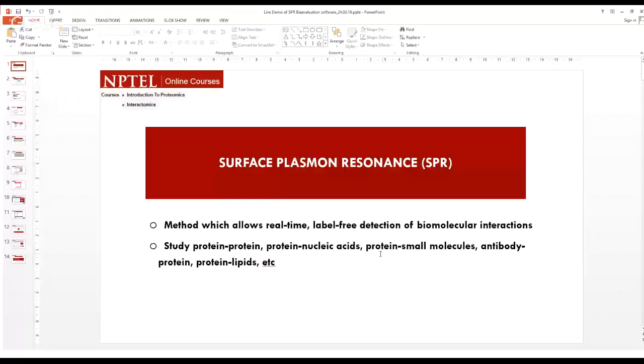For those of you who are joining us live and those who will watch later, we hope this small hands-on session will get you interested in using SPR for your experiments. So before we start with the data analysis, let me give you a short introduction on SPR to brush up on the basics of SPR. So we'll go over to the PowerPoint presentation.